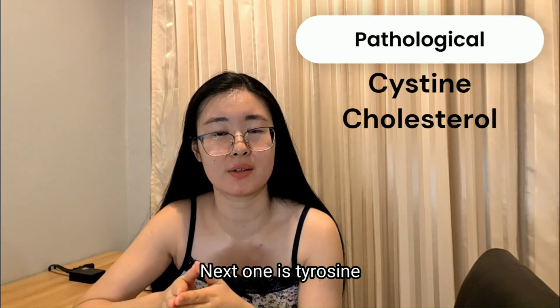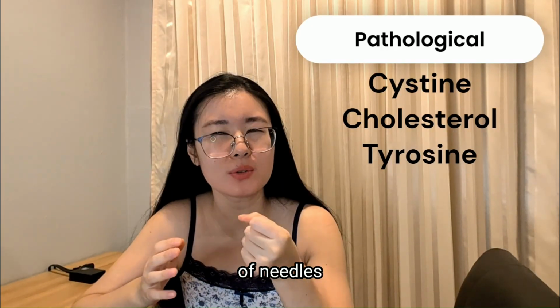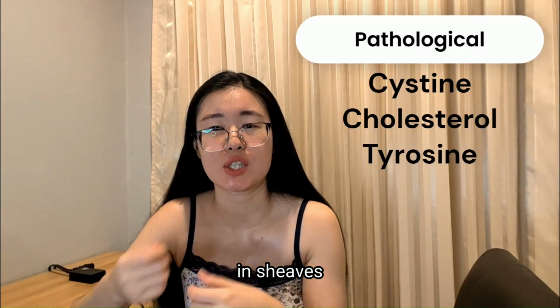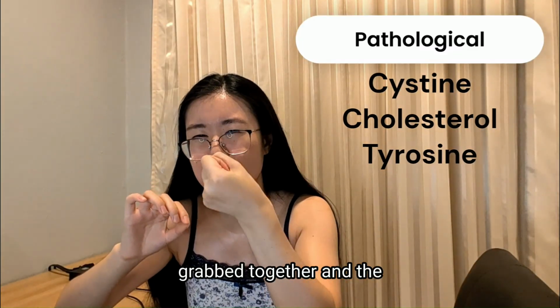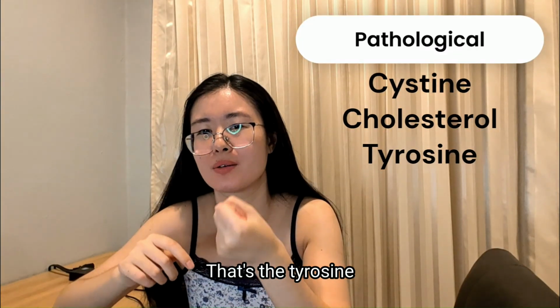Next one is tyrosine. The shape of it is like a bundle of needles. This one is described as needles arranged in sheaves. If you look at pine leaves, it's like the needle type where one end is grabbed together and the other ends are just sticking out. That's what tyrosine is.